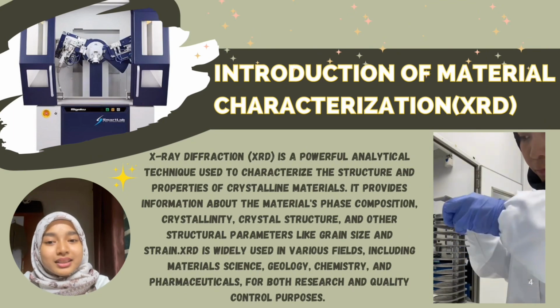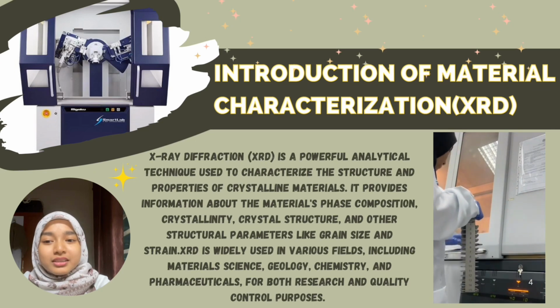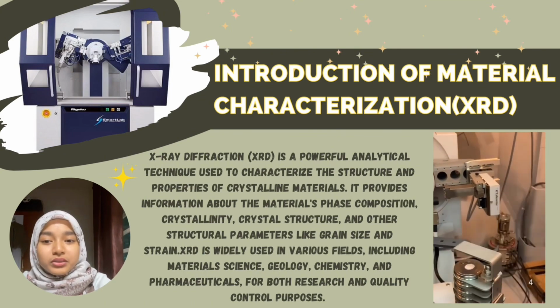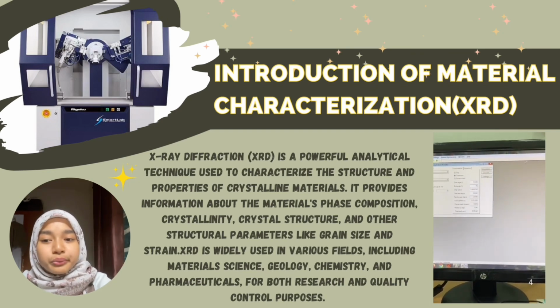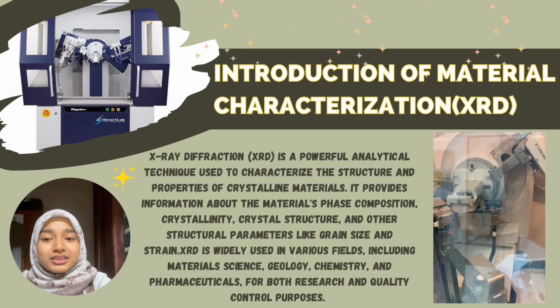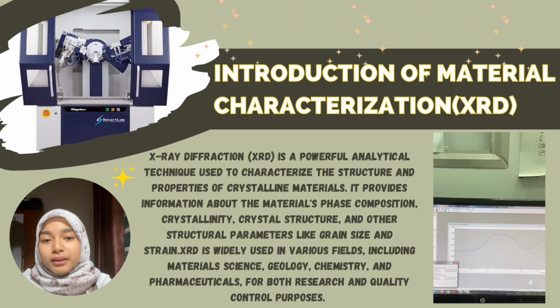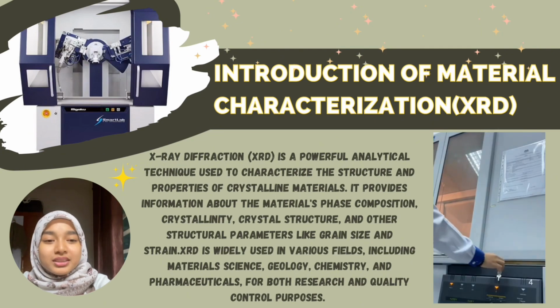and strain. This technique is widely used in material science, geology, chemistry, and the pharmaceutical industry, not just for research but also for quality control. Whether it is identifying unknown compounds or verifying the purity of a product, XRD plays a crucial role. In today's presentation, we will take a closer look at how XRD works, how it's applied to real-world scenarios, and what the future holds for this technology. Let's begin by looking at how it fits into the broader fields of scientific instrumentation and application.